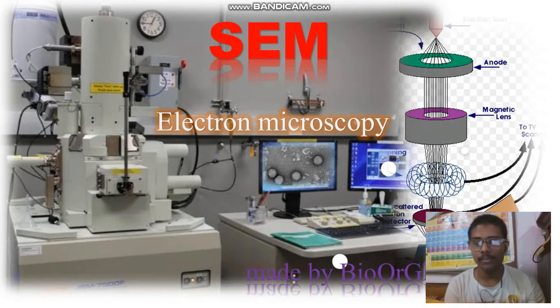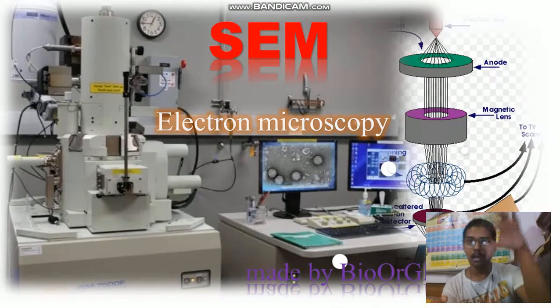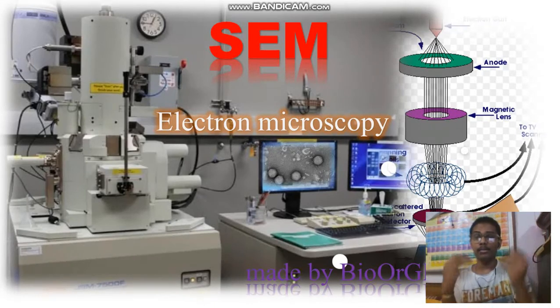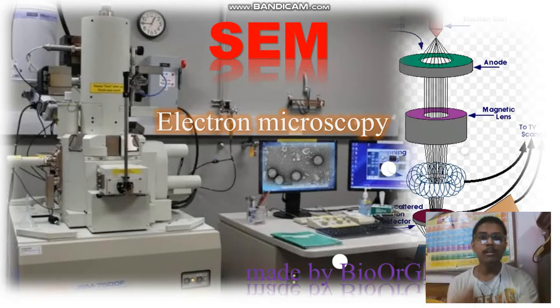upper surface information. So, in a very lucid manner to say, for scanning electron microscopy, electrons come and fall on the surface of the specimen, make some interactions with the atoms of the material of your specimen present at the surface or near surface, and again come back in some new form. So these coming back electrons are going to be captured by some detector which actually contributes to the image formation. So these coming back electrons depend upon how much interaction is happening.